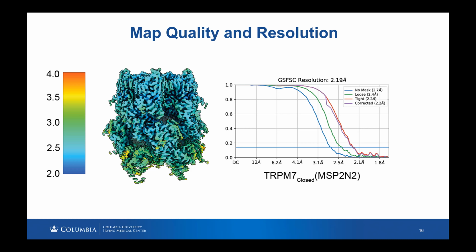With respect to data processing, why shift between CryoSPARC and RELION when CryoSPARC can do pretty much everything that RELION can do? I absolutely agree with this, that CryoSPARC basically can do everything that RELION can. So again, this work was done about 2 years ago. We started this processing, and we decided to stick to the same processing style.